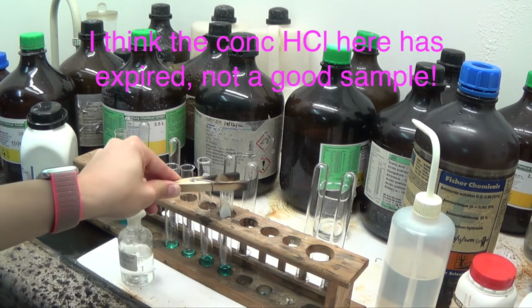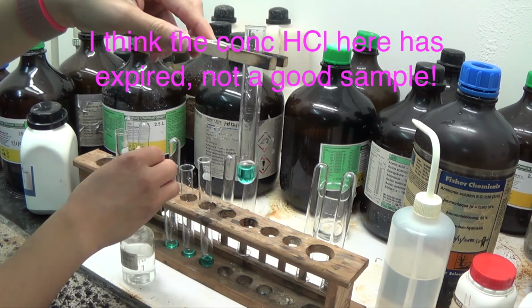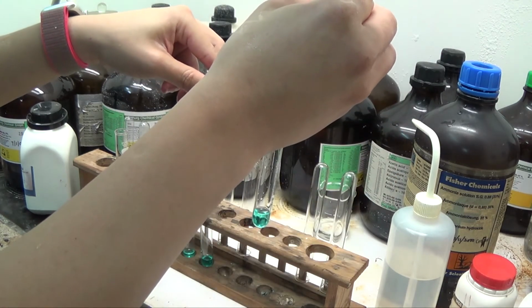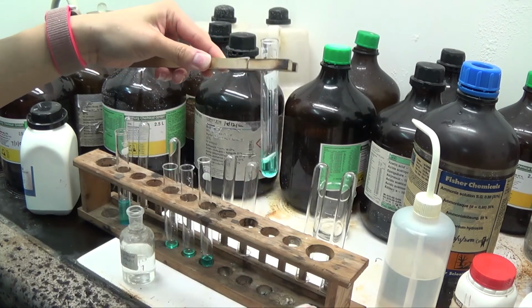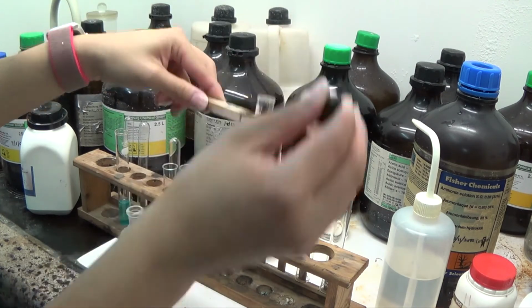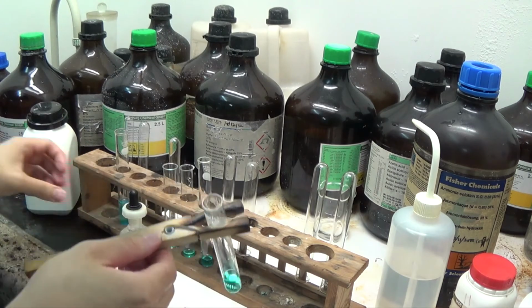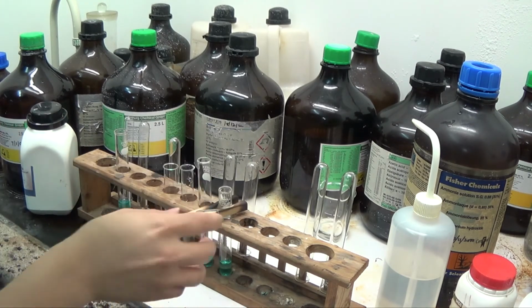Oh no, I think it was this one that I was supposed to add. So this blue solution, I add concentrated hydrochloric acid to it, and it's not showing me anything. I don't think this hydrochloric acid is still that good.